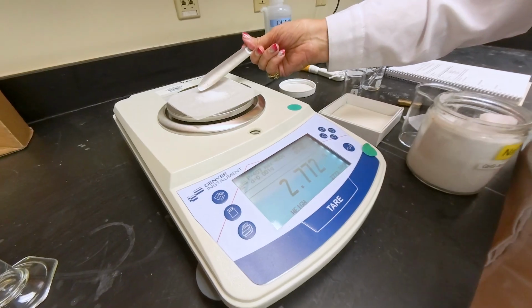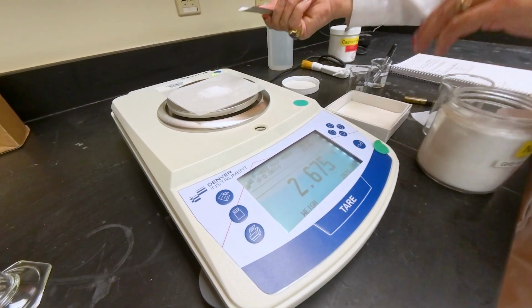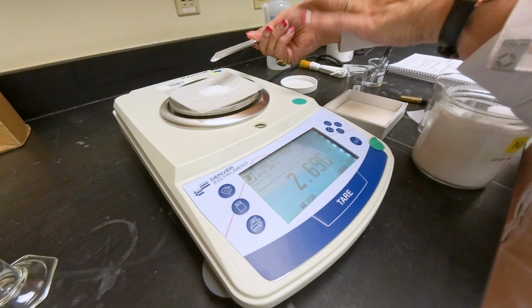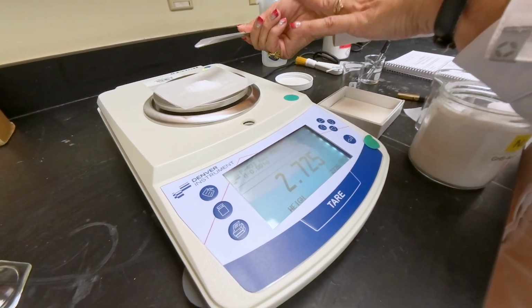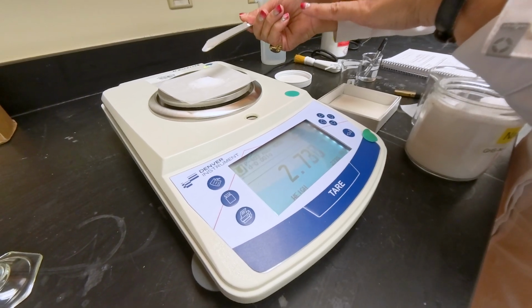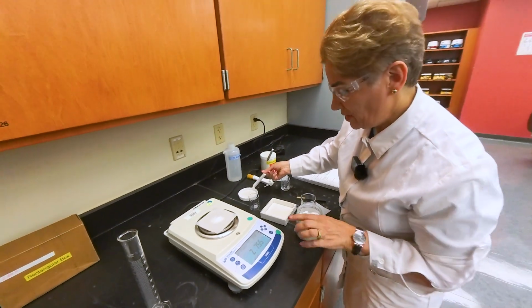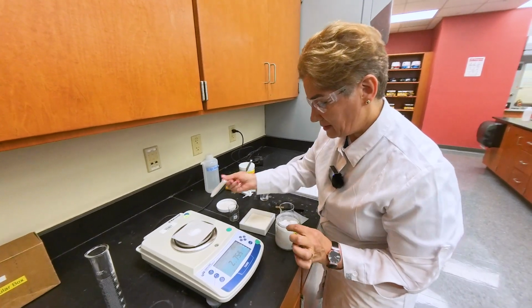If you have extra, you can remove some and try it again until you get to exactly 2.750. As I said, this is going to take some time, so be patient, and whatever you take from that scale now, you're not going to put back in the container, you're going to discard it.